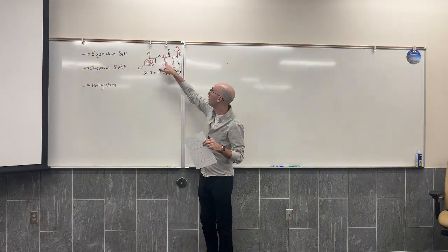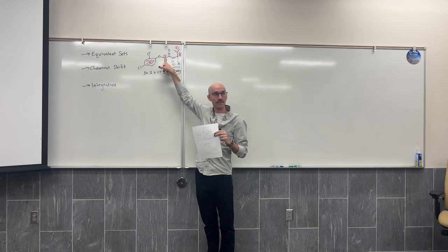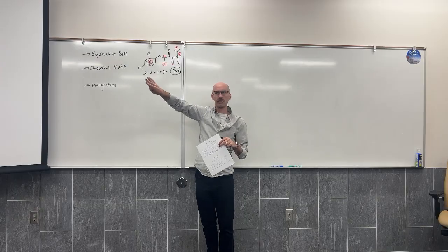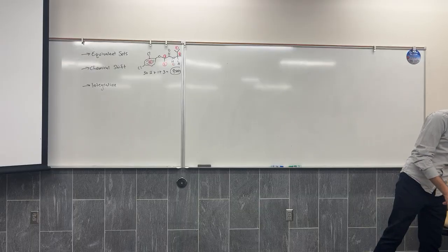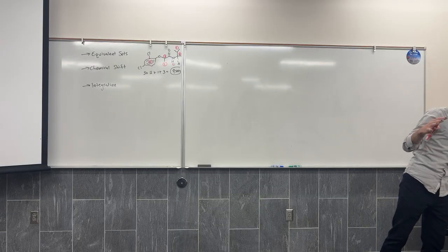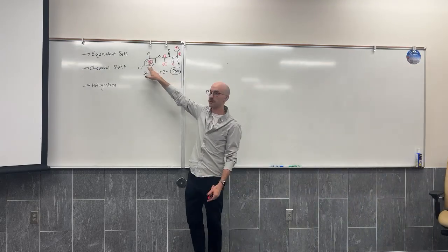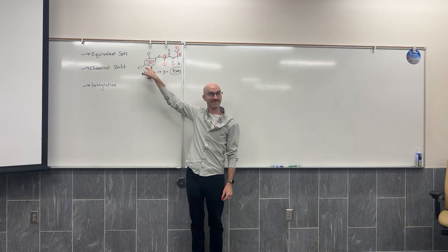So I think it's safe to say we know that number 3, the one that's functional group adjacent twice, is the one that looks like it might be in the vinylic region because it got shifted so far to the left. Rowan? Didn't we say like the aromatic ring ones are 7? Yeah, so the 3 signals, or what kind of looks like 3 signals from 6.5 to 7.5, those are our aromatics. Perfect. So you're saying the number 3 you have up there would be more to the right than the 4, even though it's that close to carboxyl.